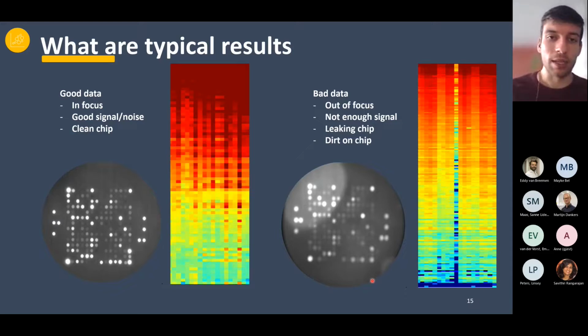What then happens is that you might not get enough signal, and you get this very obvious distortion in your heat map. The image that I show you here belongs to this sample, which is completely different compared to the other columns in this heat map. This was enough for us to say, okay, this sample is an outlier, and it doesn't give us any data that we can use. So based on that information, we discarded this sample from the analysis.